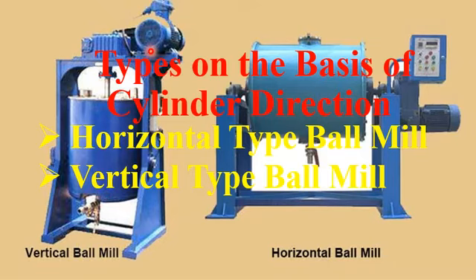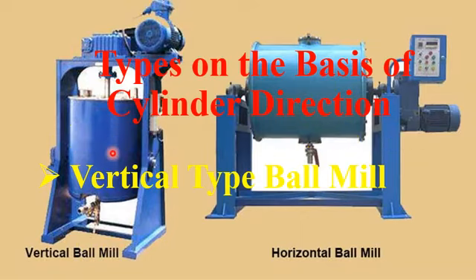Okay, so students, please note that the horizontal ball mill apparatus is used for grinding and dispersing under closed conditions. So dear students, in simple words, the horizontal ball mill apparatus grinds and disperses the bulk material in a closed condition, which basically prevents the volatilization of the solvent which is usually incorporated in ball mill machines.